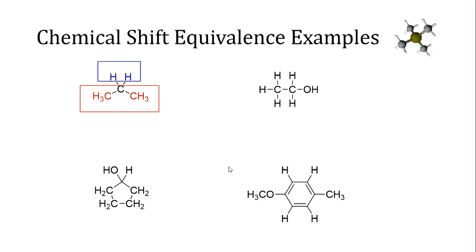Generally, any two hydrogens or groups of hydrogen atoms that can be interchanged by a symmetry operation are probably chemically equivalent, whether you flip the molecule around an axis or reflect it in a mirror plane. This is why enantiotopic hydrogens, while maybe not related by rotational symmetry, are still mirror images of each other, and they happen to be chemically equivalent.